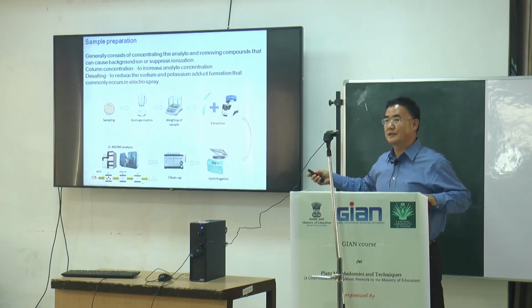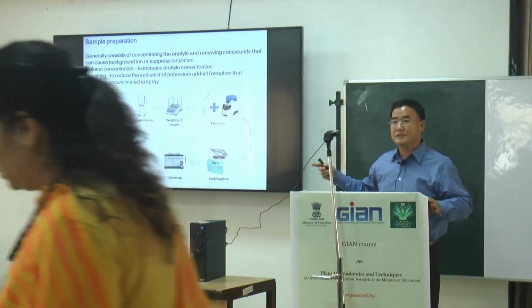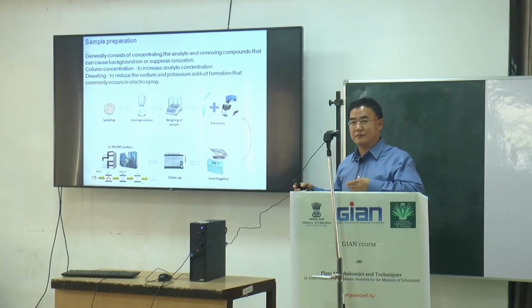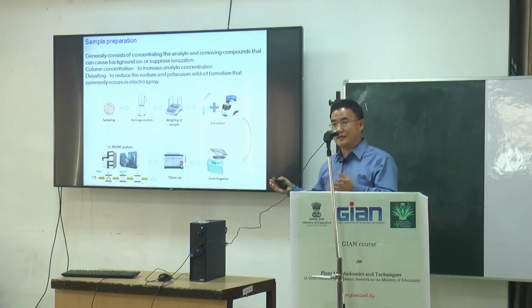It's very important. In the second class, initially we designed to tell more details about the sample preparation for LCMS or GCMS or other types of chromatography analysis.